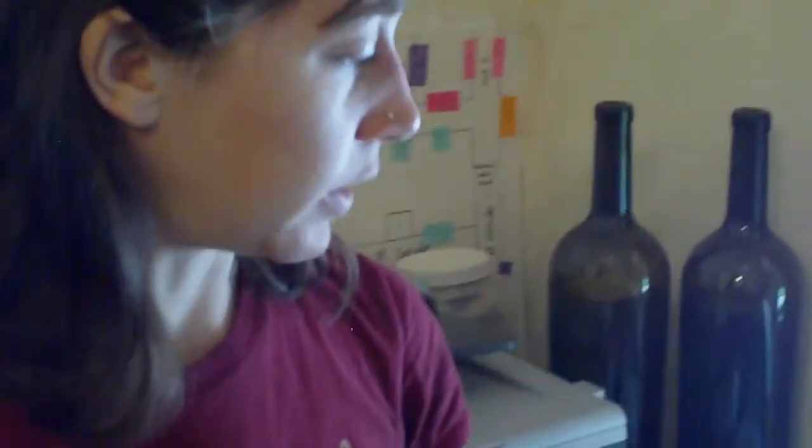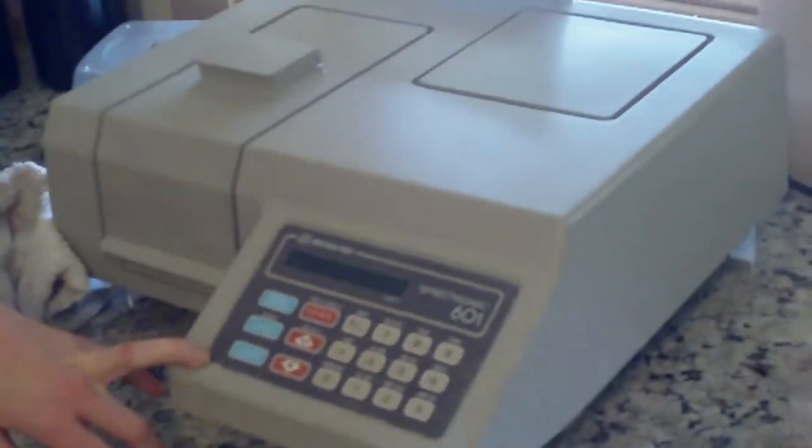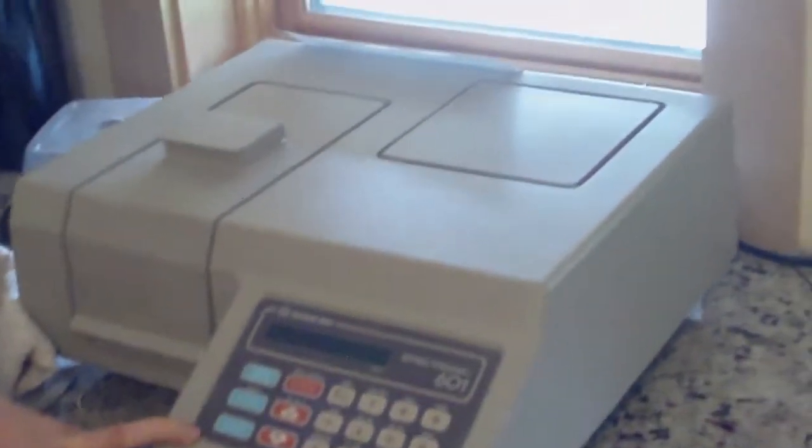But I know you can, because it just measures the wavelength. I bet that's an expensive piece of equipment. Yeah, this one wasn't too bad. I mean, this is used, and it works well. But for a new one, yeah, they would be very expensive.